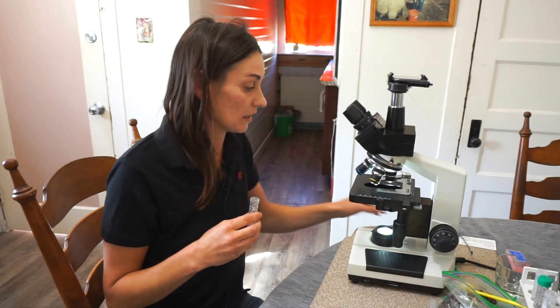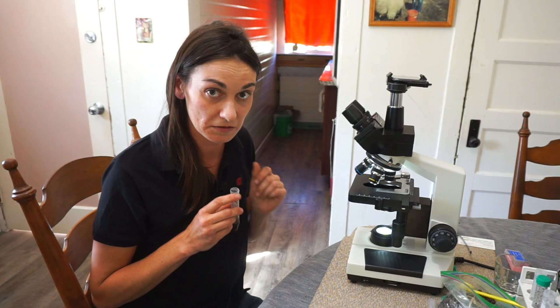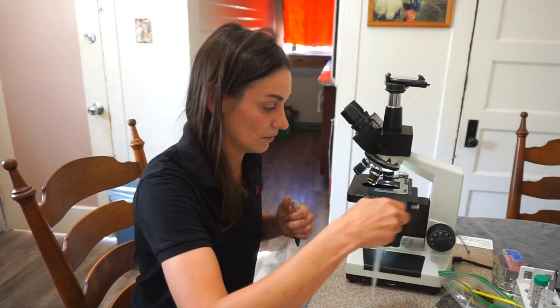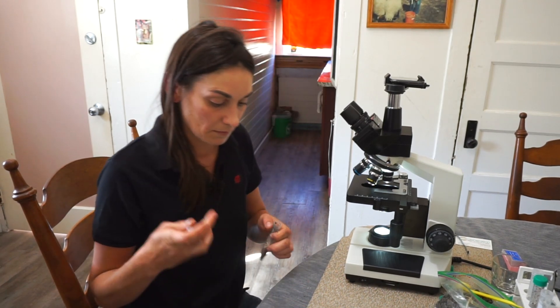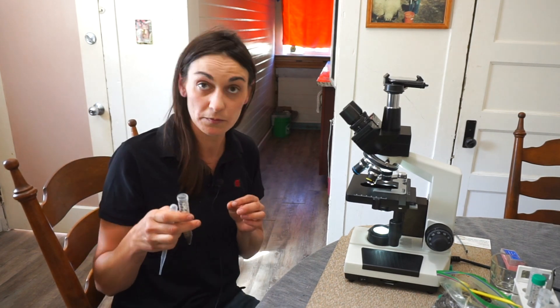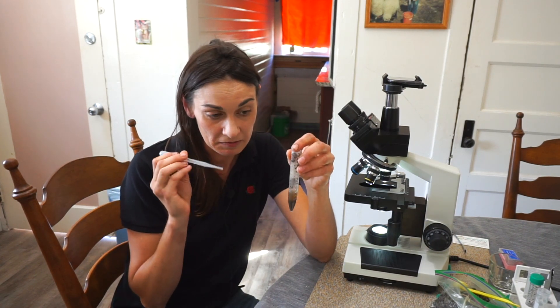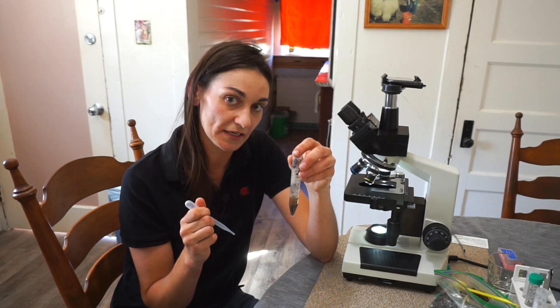For those of you that wear glasses, never look through the microscope with your glasses on. I always like to look at multiple slides from every sample so I can pull from different depths of the slide. It's crazy how different you will see depending on what depth you take your sample.